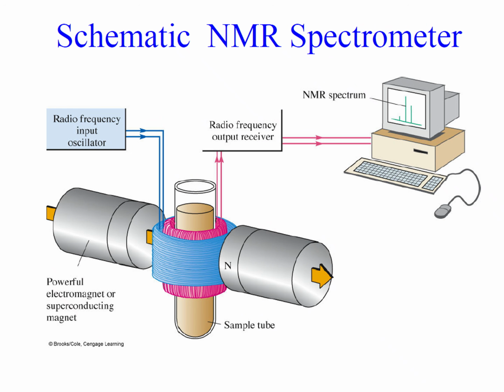Here is a schematic diagram of an NMR spectrometer. Like other spectrometers, it contains a detector, a recorder, and a sample compartment. However, the main difference is that it contains a powerful electromagnet or superconducting magnet, and this differentiates NMR from any other spectroscopy like UV, atomic absorption, fluorometry, or IR spectrometry. The notable thing is that in NMR we usually use radio frequency.